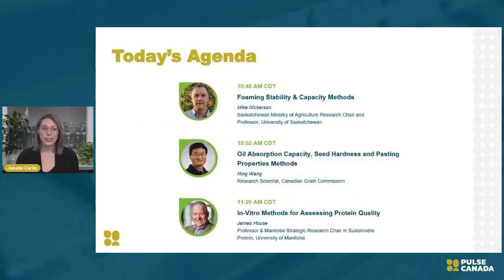So today's agenda, we're going to be talking about some methods in particular. There's been some work under the Pulse Science Cluster that was funded by the Canadian pulse industry here in Canada that Dr. Ning and Dr. Nickerson were involved in, working towards foaming stability and capacity method development, oil absorption capacity, seed hardness, and pasting properties. So they're going to be presenting some of that work here today. And then we're also joined by Dr. Jim House, who's going to be talking about some in vitro methods for analyzing protein quality as well.